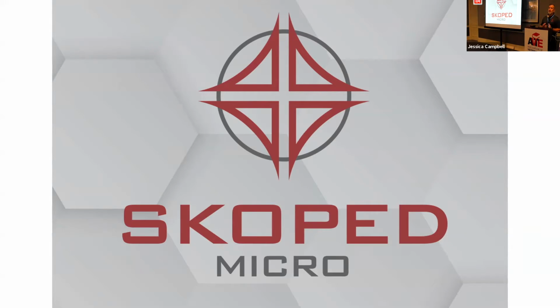And so in all my cytology, I was taking pictures and writing notes and making my day go a lot faster. But it also made my rechecks way more efficient because I had a picture, not just terrible handwritten notes. And so I could follow up way more efficiently with my clients because I could show them where we were and where we had come. And so, man, that made it real.